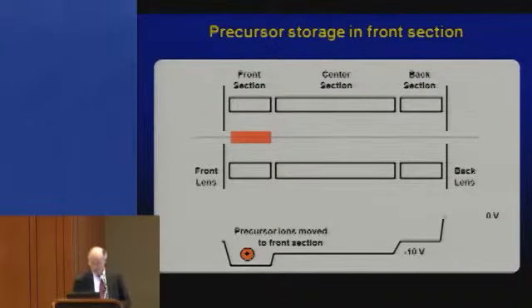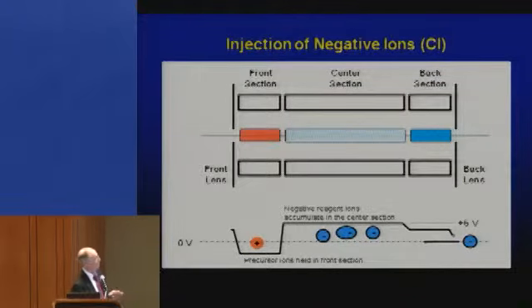And then you generate your negative ions from the back end of this device. Negative ions come in. There might be multiple things there, so you want to purify it by irradiating and kicking the ones out of the trap you don't want. You only want the one that will transfer an electron, not the one that will pull protons off, for example.